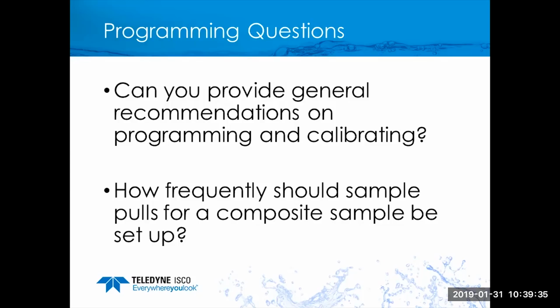Those options can be very broad in range, and not every application would be able to utilize any given programming or configuration option. So that would be the first question, is understand what you're doing, why you're doing it, because that's going to drive what you select in your programming selections. There are some basic things that can be indicated, such as, again, know what you need, know what the conditions you are being asked to operate in, as this impacts those programming decisions.